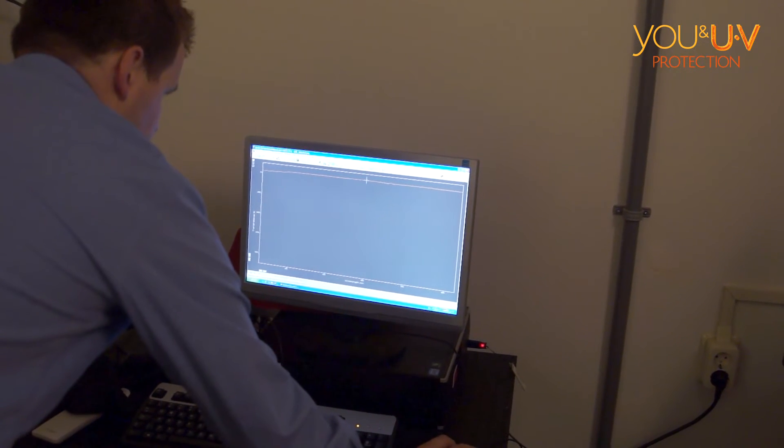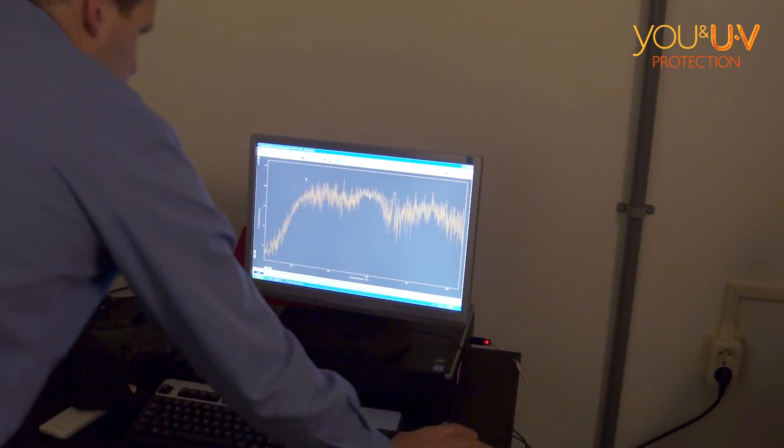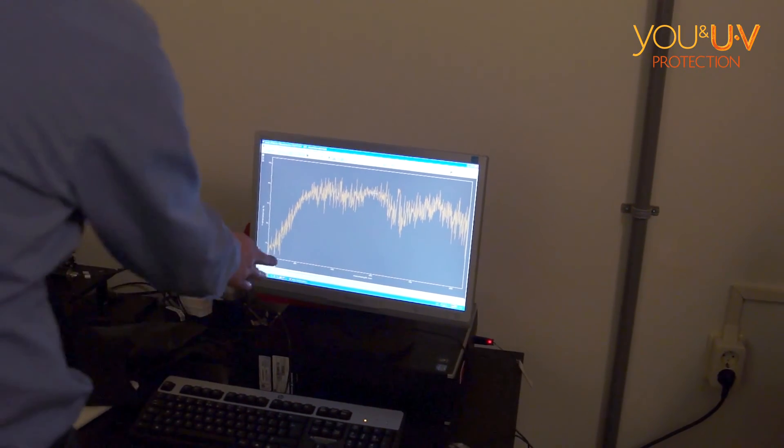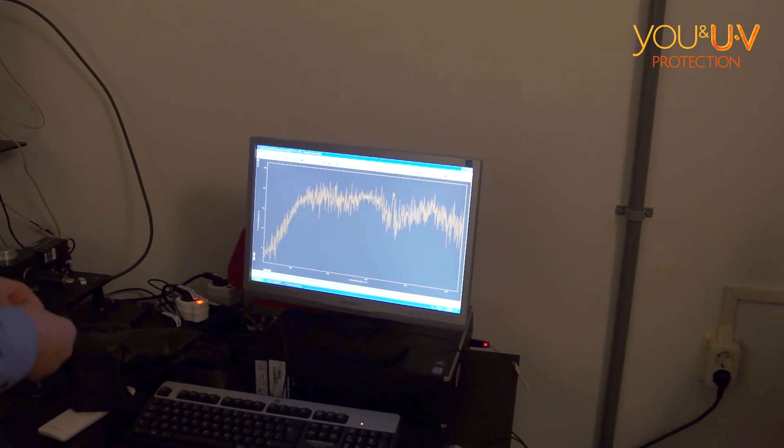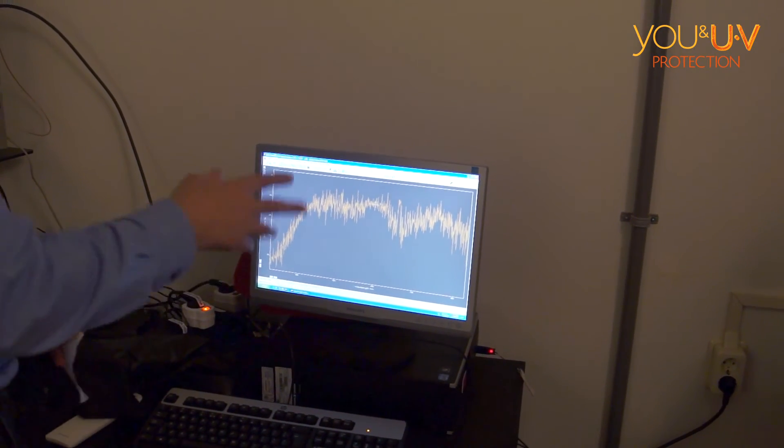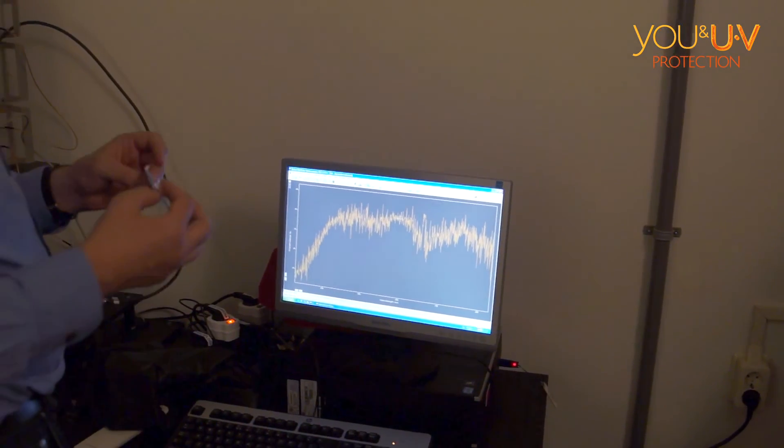So this cloth is quite good at blocking. This is your percent transmittance. It blocks in this region about 75% of light, and in this region about 40% of the light. Now this is not an accurate measurement because I'm not setting up correctly, but this is a UV blocker?